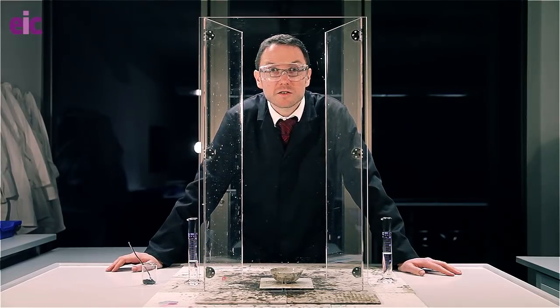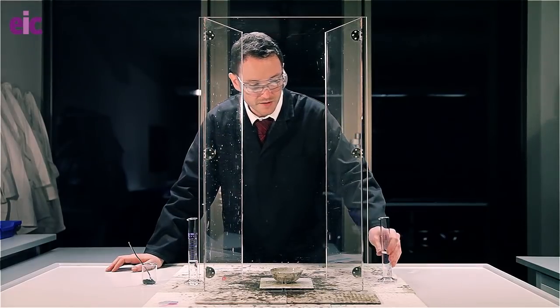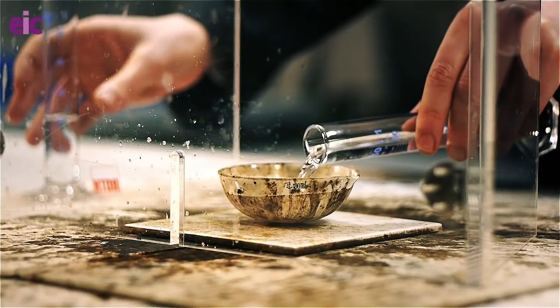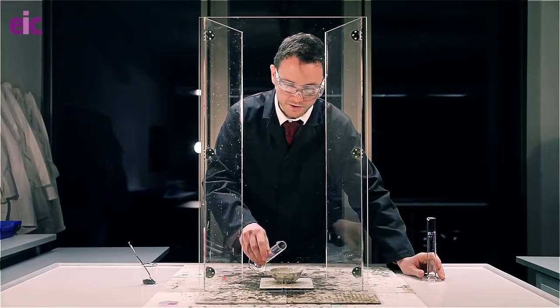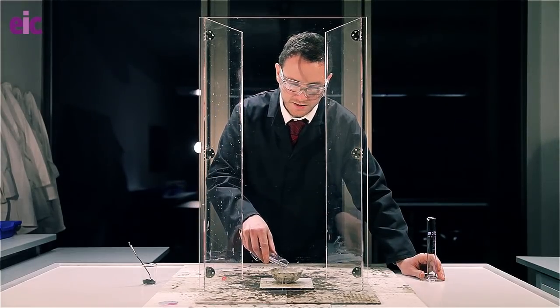It's important when you're actually starting off with this demonstration that you put in the hydrogen peroxide first. If you follow up with the ethanol, then when the ethanol is on top, it's going to be a lot easier to light.